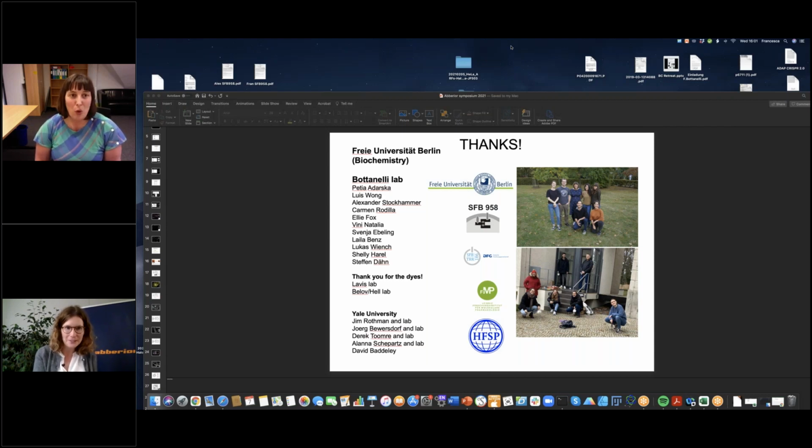I have to admit that there's always quite a bit of background. In particular, you always see little endosomal structures, but that is usually in the cells that do not express your target. When your target is present, the background seems to become much better. And again, in comparison with SNAP and Halo, SNAP always gives much more of these problems than the Halo tag. So if you have a single color, I would always recommend working with Halo.